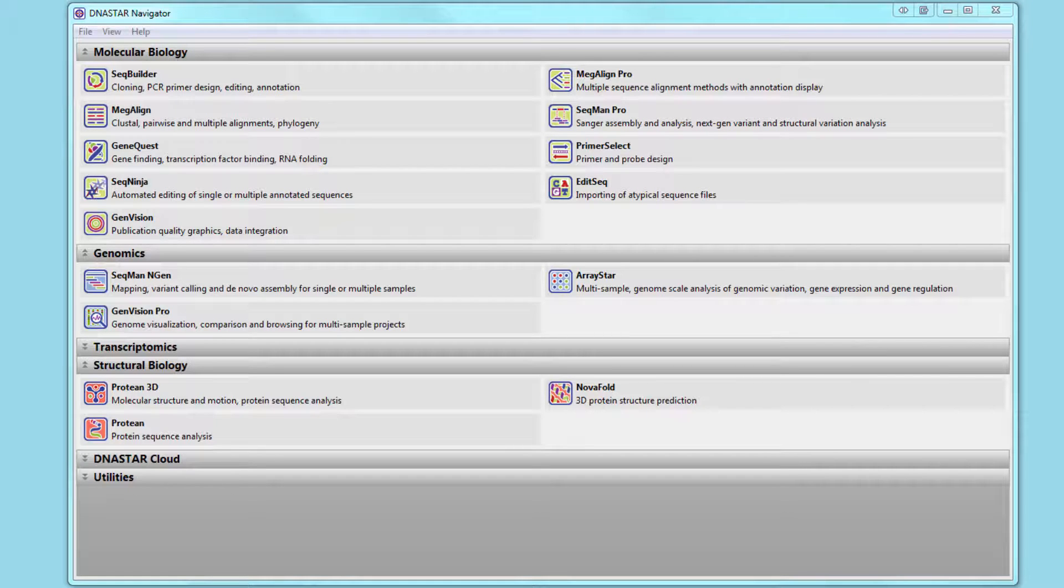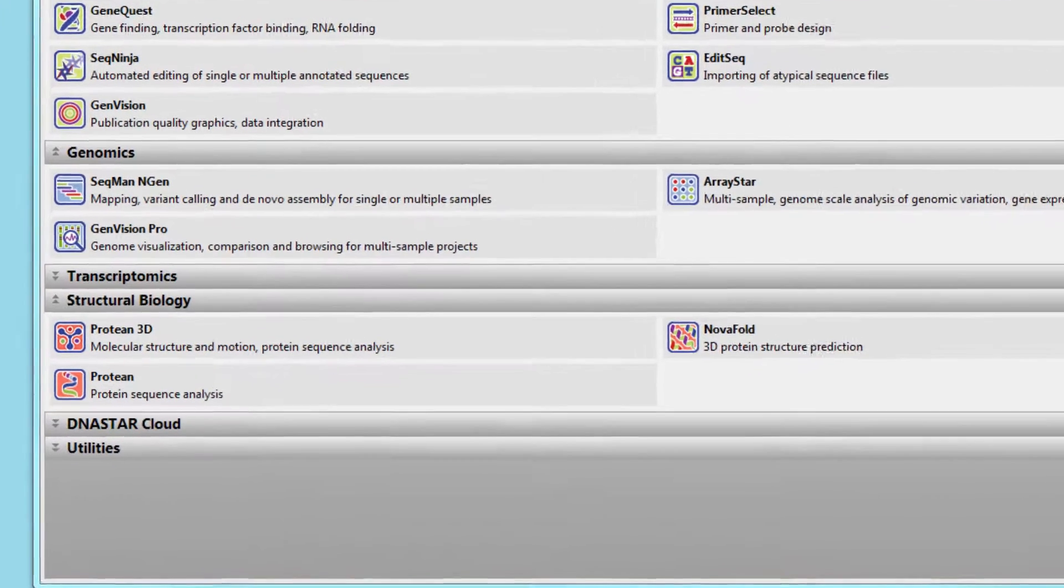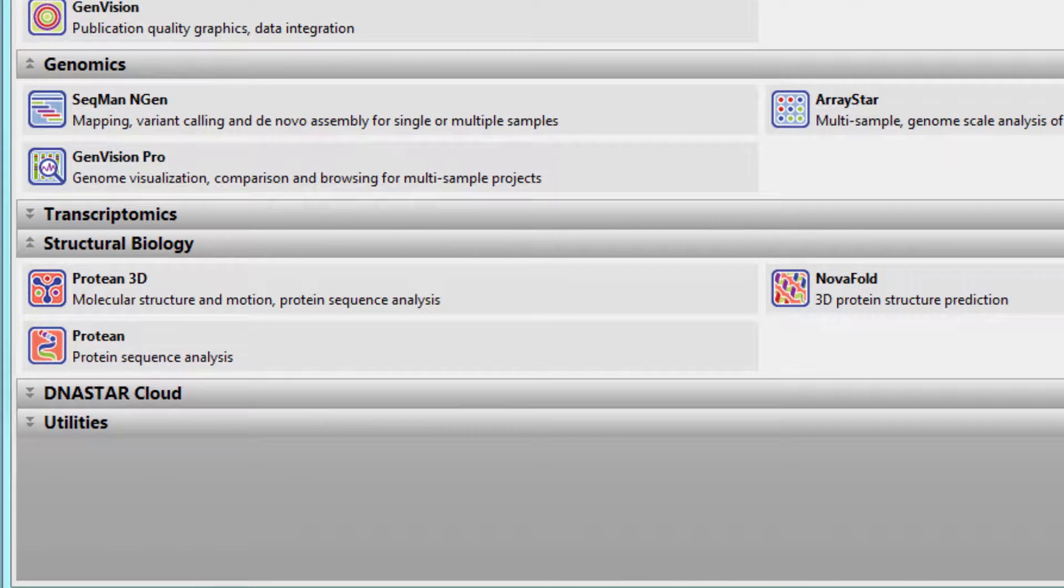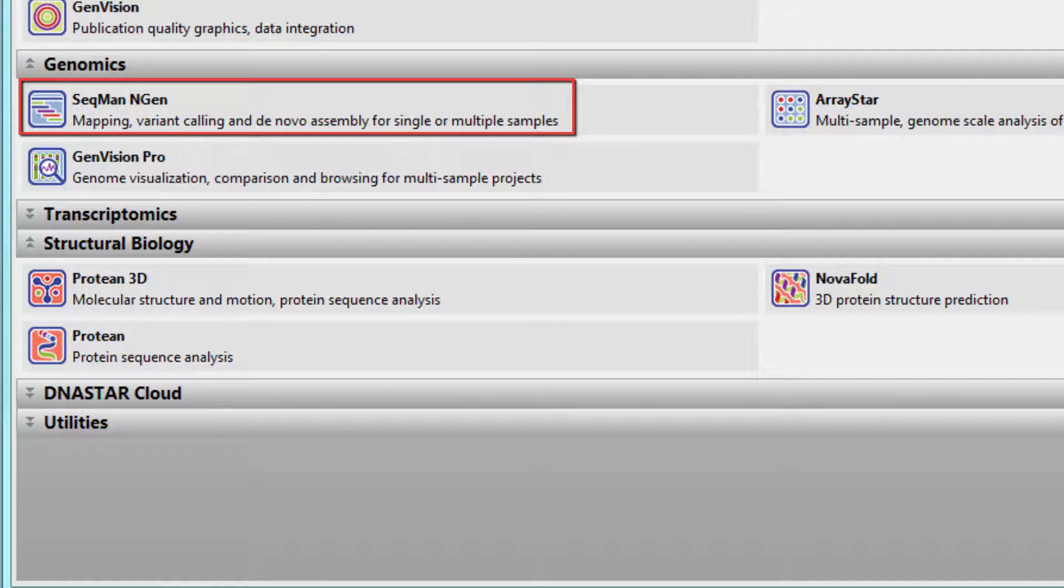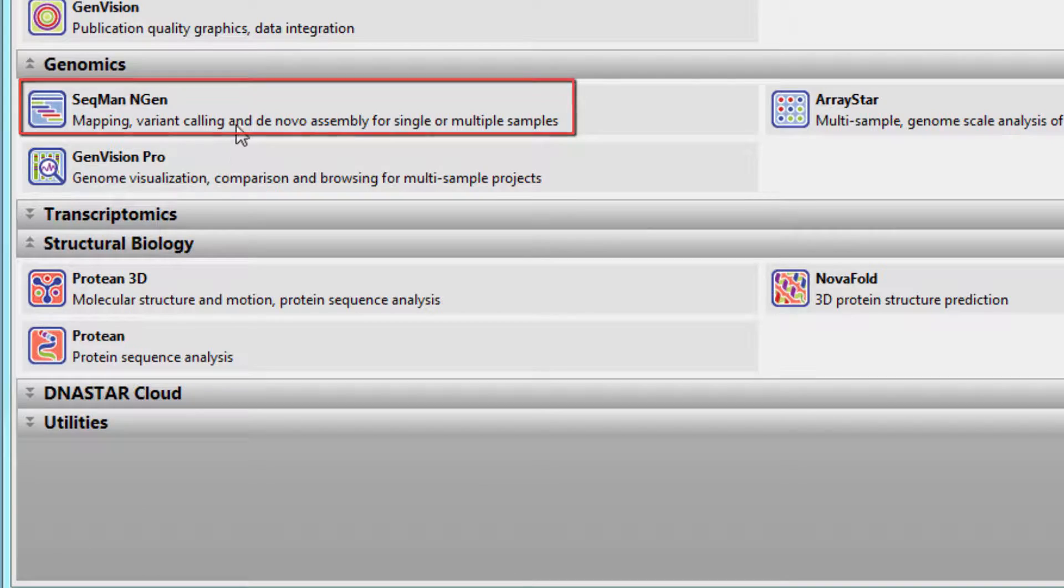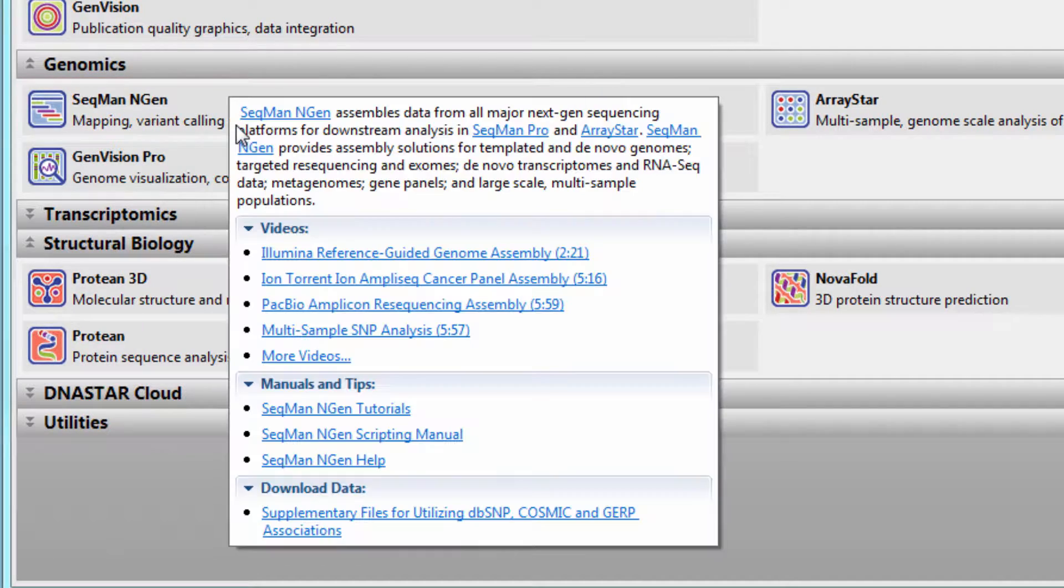If you're working with next-generation sequencing data, you may wish to use Sanger sequencing to validate the results of your assembly or variant calls. LaserGene Genomics Suite supports this type of validation, allowing you to combine both data types in a single assembly with SeqMan NGen.